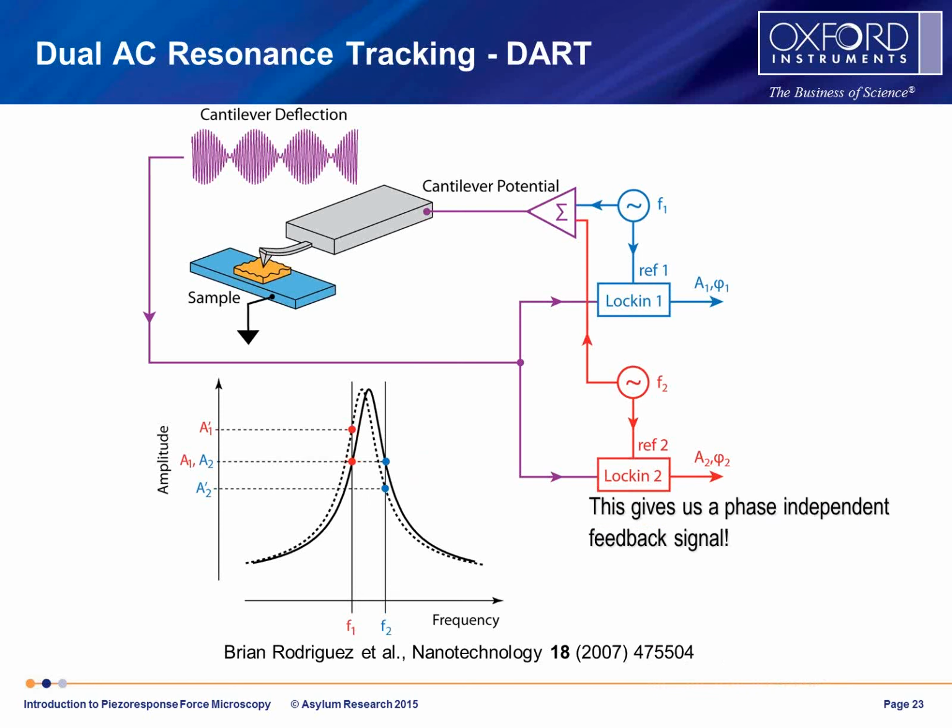So by putting that in there, we have a phase-independent feedback signal, and that lets us follow the resonance, so we get all the benefits of that built-in amplifier from Mother Nature, the cantilever contact resonance, with greatly reduced crosstalk between the sample topography and the amplitude and phase. So I'm just going to show you one example of that.